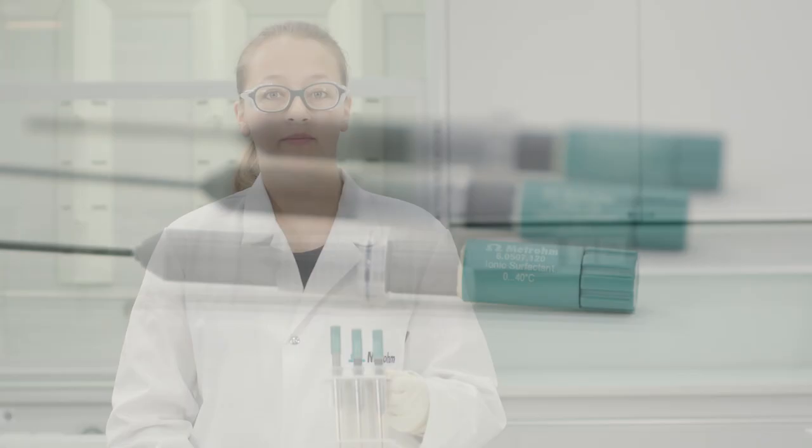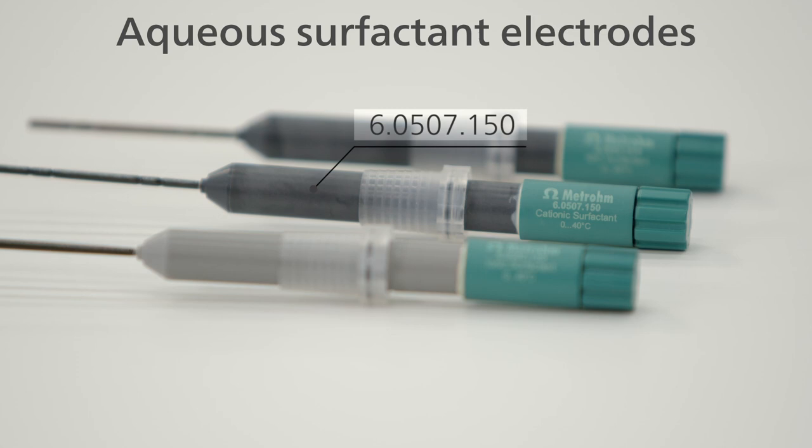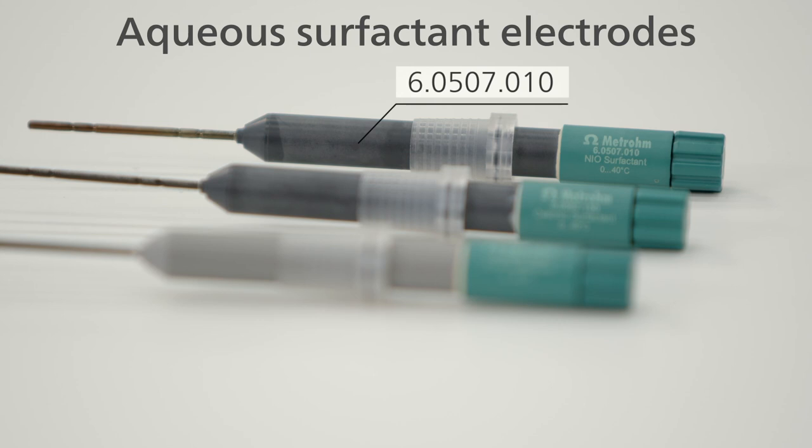The ionic surfactant electrode can be used for both anionic and cationic surfactants. If you only need to titrate cationic surfactants, we recommend the cationic surfactant electrode. And for non-ionic surfactants based on polyoxyethylene adducts, use the non-ionic surfactant electrode.